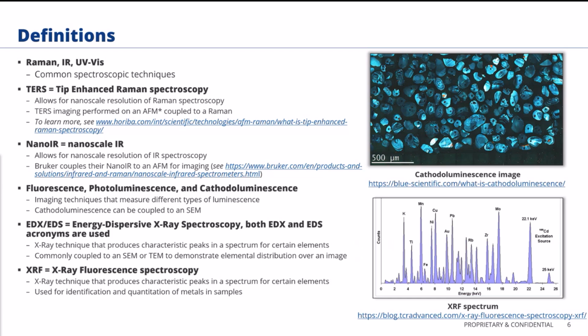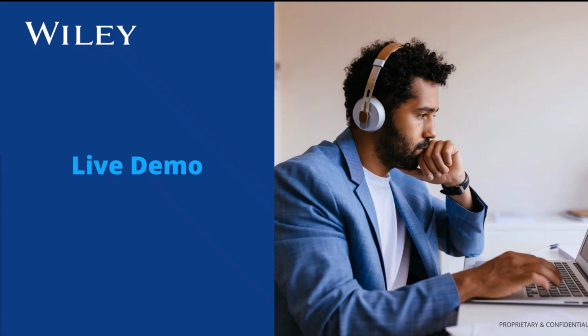And finally, XRF for X-ray fluorescence spectroscopy. It's an X-ray technique that produces characteristic peaks in a spectrum for certain elements. It's used to identify and quantify metals in a sample. So next, I'd like to perform a demonstration of the software.